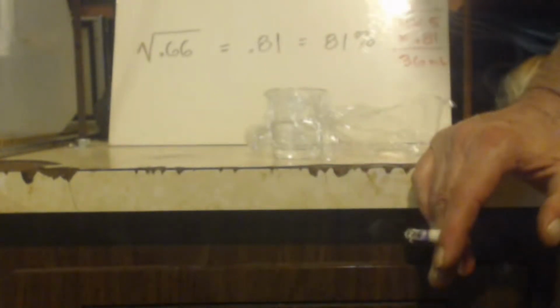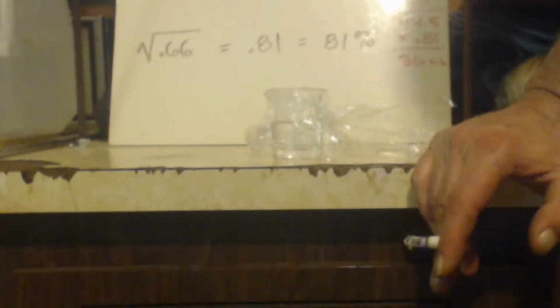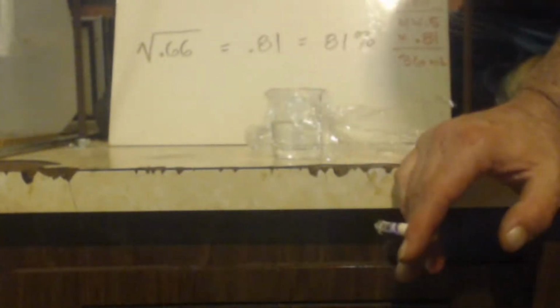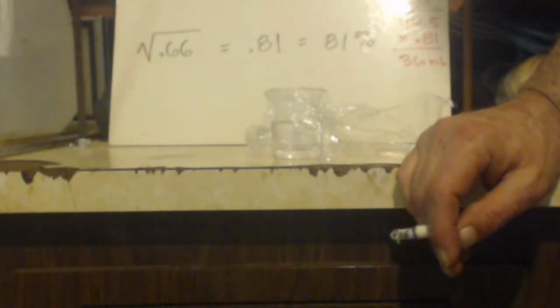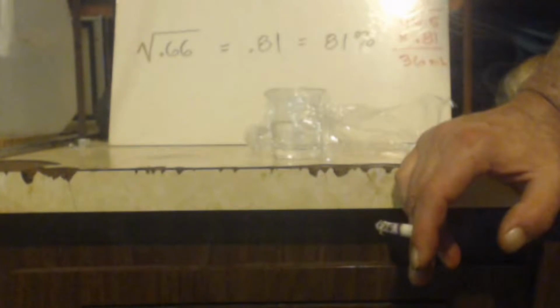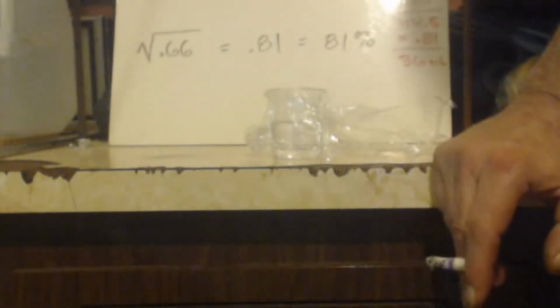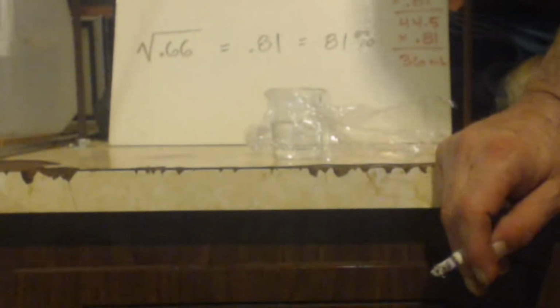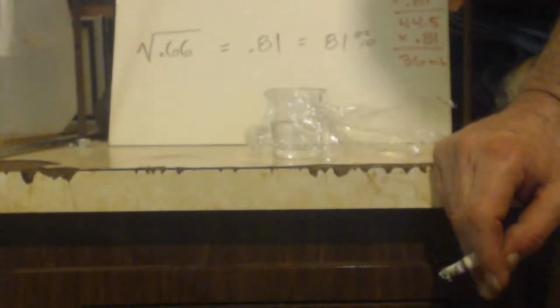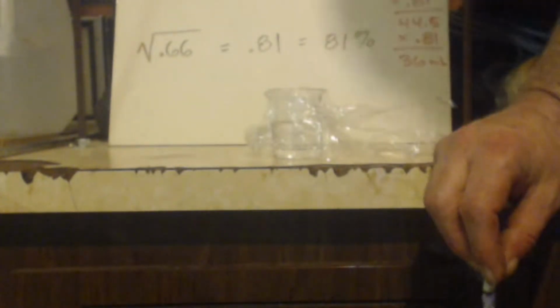But what I wanted to do was distill it a second time, that lower fraction that had the impurities in it, you know what I mean? And I ended up mixing them together like an idiot. So I'm not going to, but I should have distilled that one again and then taken my upper boiling points of that and put it with the 12 milliliters that I got that was definitely pure. And then I would have had ultra pure. That would lower my yield, but oh well, that's all I got time for.